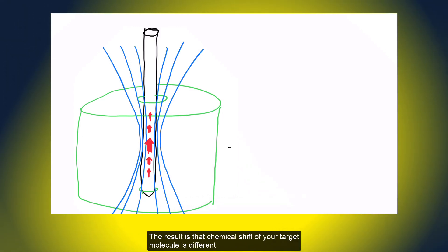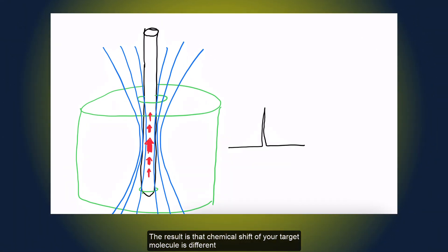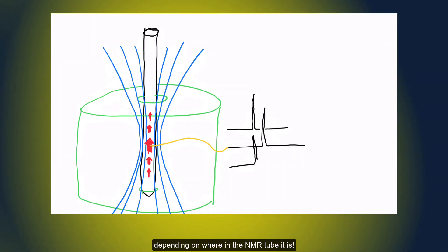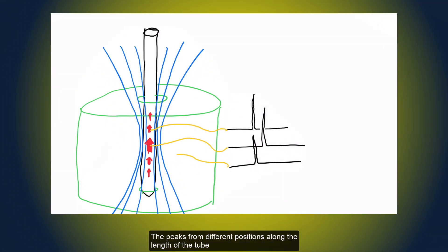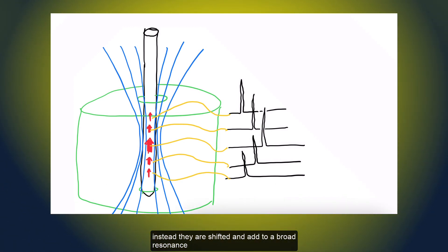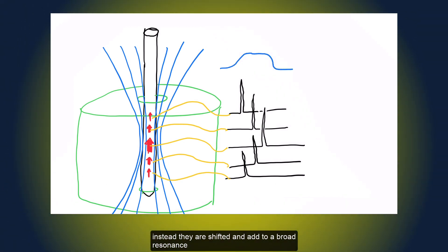The result is that chemical shift of your target molecule is different depending on where in the NMR tube it is. The peaks from different positions along the length of the tube do not come up at the same ppm position in the spectrum. Instead, they are shifted and add to a broad resonance.